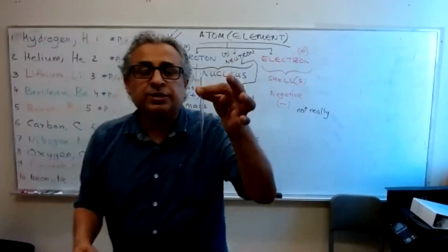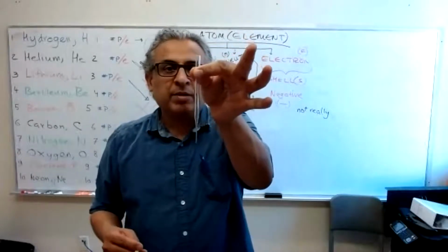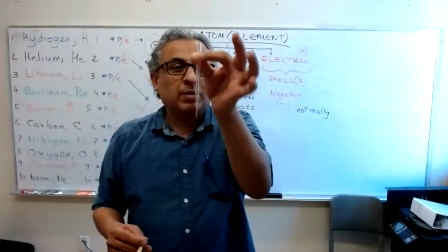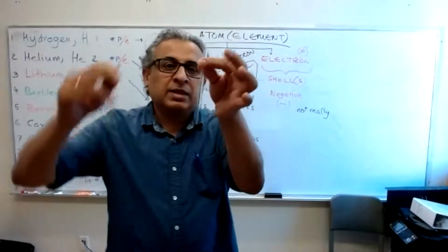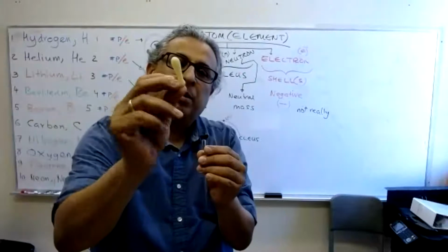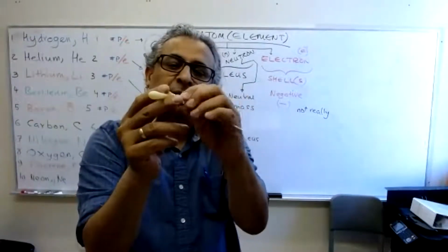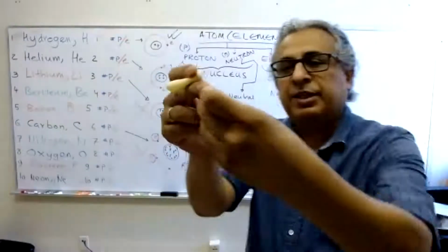This is something that you're going to be using every day in a real lab. This is a short pipette. I didn't bring the long pipette. They're disposable. Once you use it, you throw it away. This is kind of like a medicine dropper. You have seen it in the past. This is a pipette bulb. We don't get the medicine dropper kind of setup, but we make it ourselves. So you attach it here.